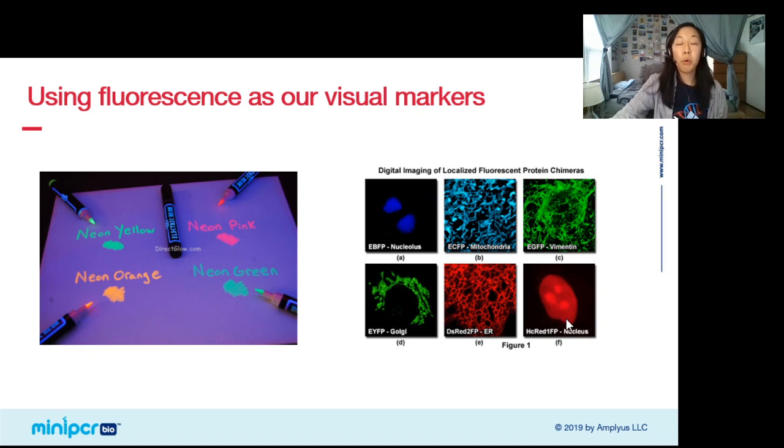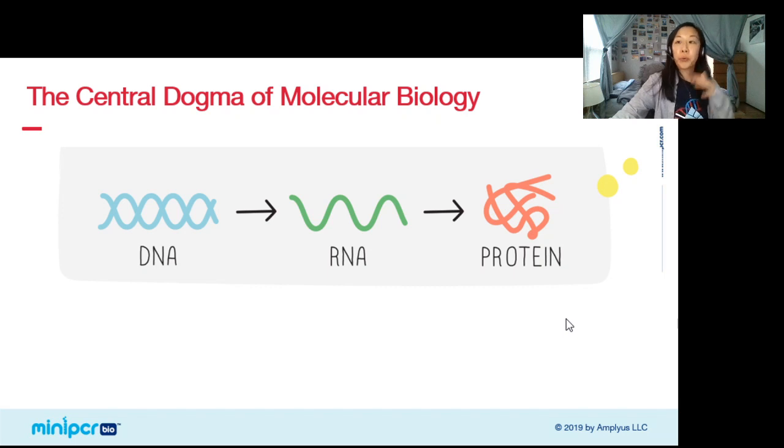For today, we'll be using both fluorescent chemicals and proteins in this lab to light up the central dogma so we can actually see when RNA and protein get made. And as an aside, teachers, if you are curious about how this fluorescence in proteins actually works, we're currently working on a new BioBits lab that's going to cover this topic, so stay tuned. Throughout this demo, I will be briefly reviewing this process for the audience members out there who might not have learned this in class yet.